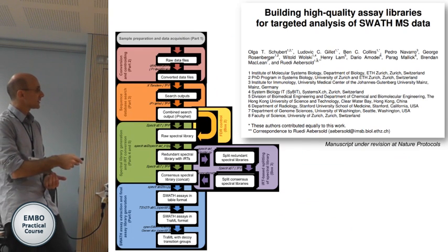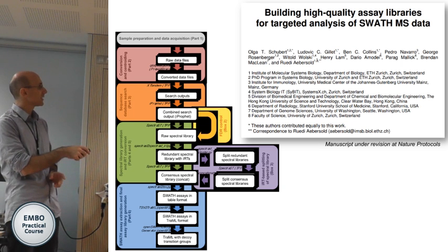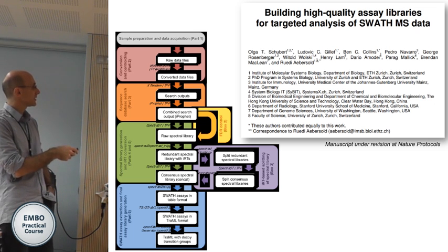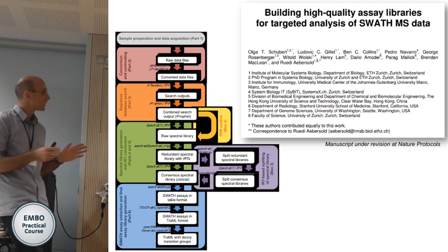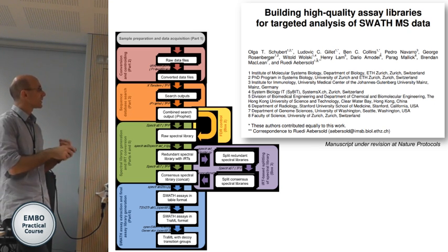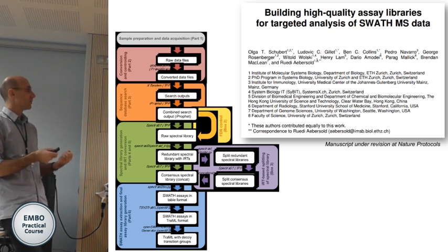So this is a manuscript that we have been writing with Olga and Ben in our lab, and this is now still in revisions. Hopefully it will be accepted soon, and this is a very long workflow with a lot of bioinformatic tools. So I'm not going to speak in detail about the bioinformatic tools that we are using. These are very technical, but I want to give you at least the little tips and tricks you need at every step in order to get the best out of your data.